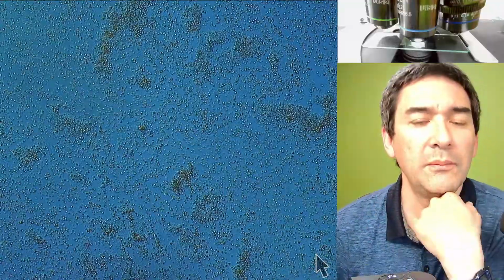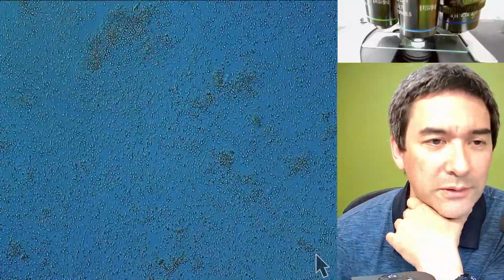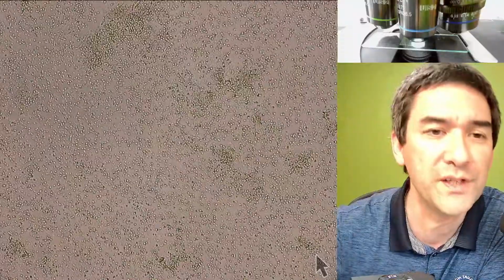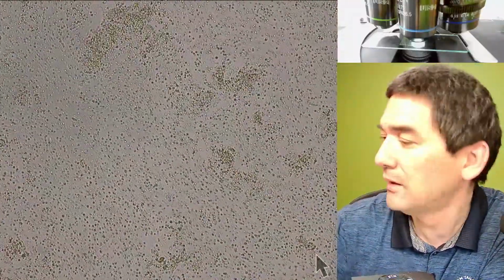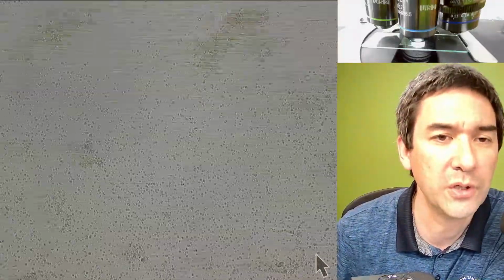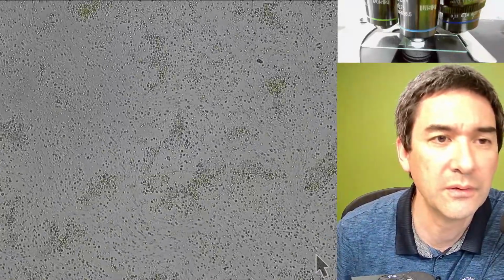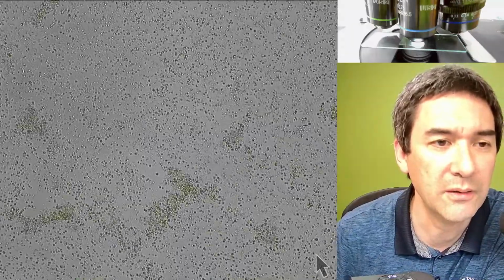Yeah, so in summary, the cells that we see here are pretty small. Considering the fact that they do look green, they're obviously greenish, they do photosynthesis. But more I cannot say. They do also have the size of bacteria as well. So they could be bacteria, photosynthetic bacteria, but I wouldn't be able to say. Just size alone is not indicative of anything.